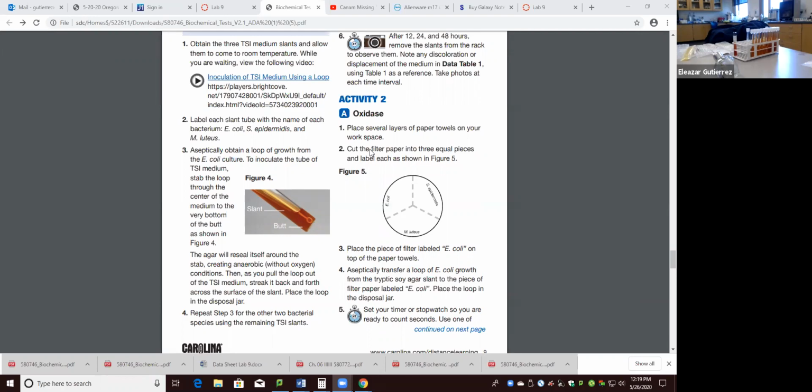What oxidase indicates is that the organism has cytochromes that can reduce compounds in its electron transport chain. So even organisms that are anaerobic and do not grow in the presence of oxygen can come out to be oxidase positive, okay? And conversely, you can have aerobic organisms sometimes come out oxidase negative. And again, this has to do with the presence or absence of specific cytochromes in the electron transport chain. And I'm going to pause here so we can look at the practical aspect of this.